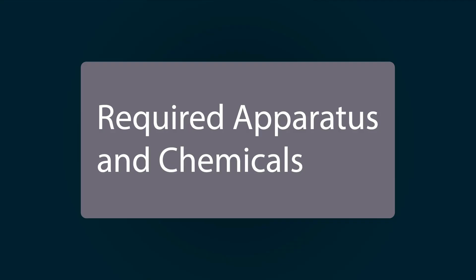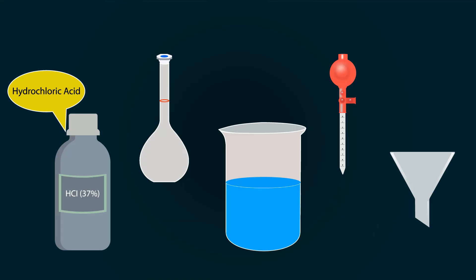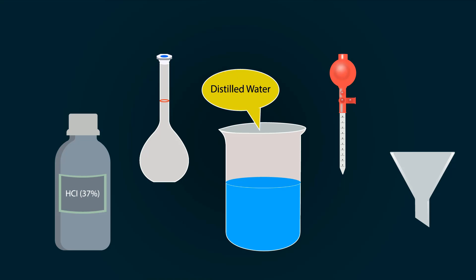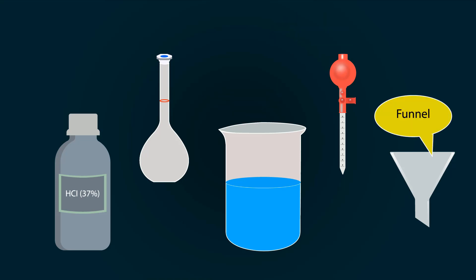Required apparatus and chemicals are: 37% HCL, measuring flask of 500 milliliters, distilled water in a beaker, a pipette, and a funnel.